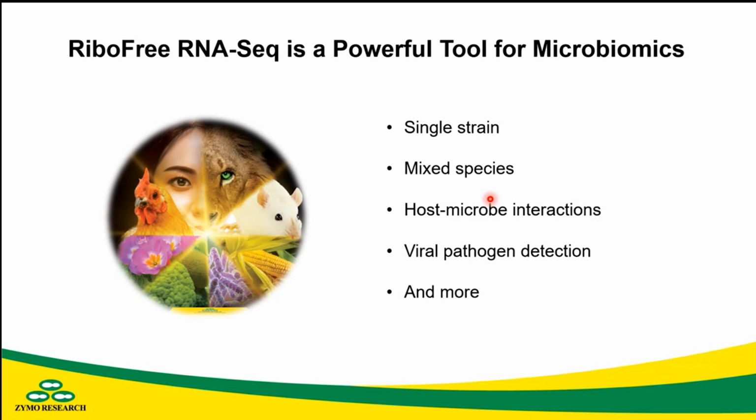Yeah. So Luis, if you're looking at shipping libraries, libraries are double-stranded DNA by the time they become libraries, so they should be fairly stable. Blue ice shipping should be sufficient. But if you're thinking about shipping samples, the RNA directly, then one method is to utilize Shield to enable room temperature transport. Another method possibly is using dry ice packaging for shipping abroad.